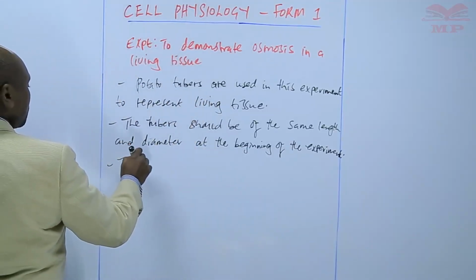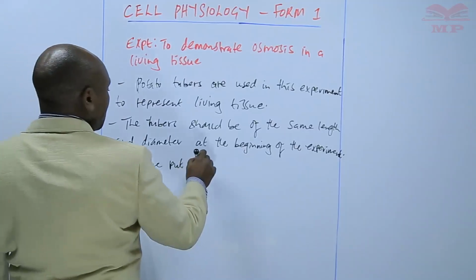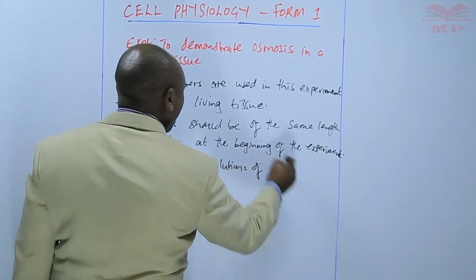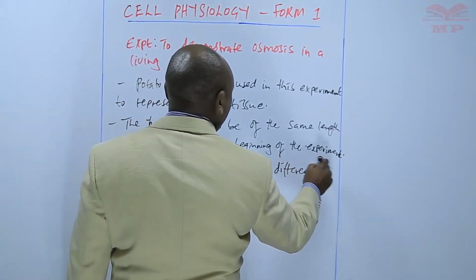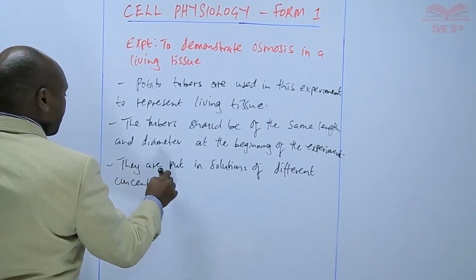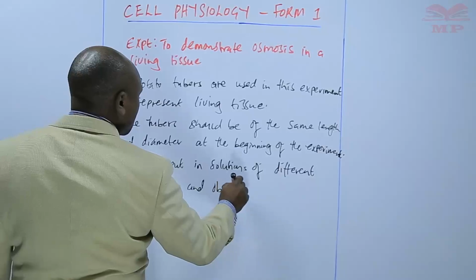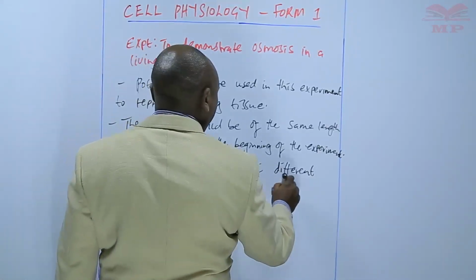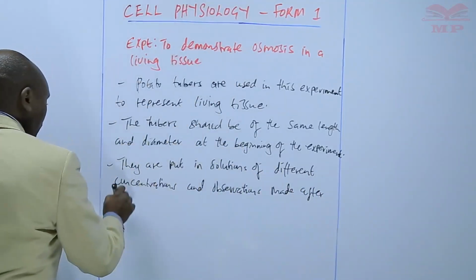They are then put in solutions of different concentrations and observations made after 40 minutes.